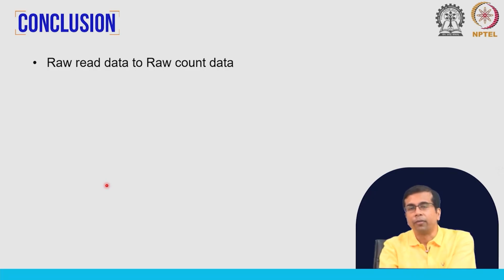We have also talked about algorithms that can account for multiple mappings of reads. This is a problem with simple tools like HTSeq-count or the other tool that we just discussed: they cannot decide whether a read comes from a specific isoform or is just counted as a gene. In those cases this can be a problem, where isoform expression is of interest in your experiment.